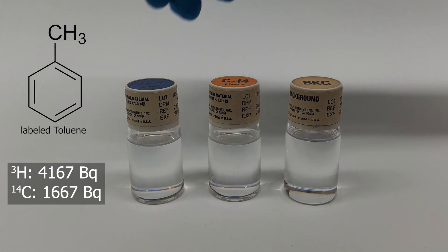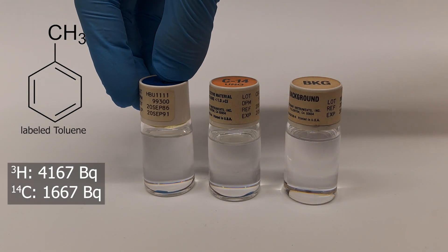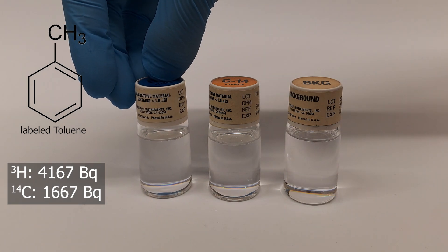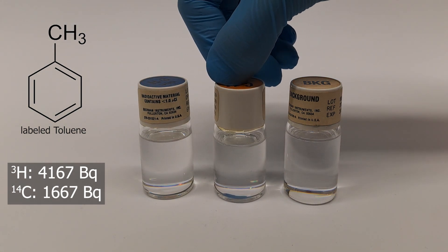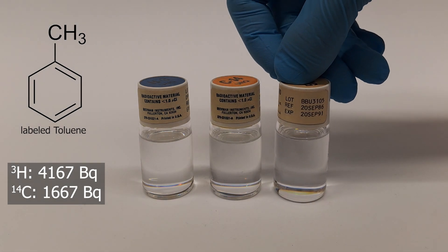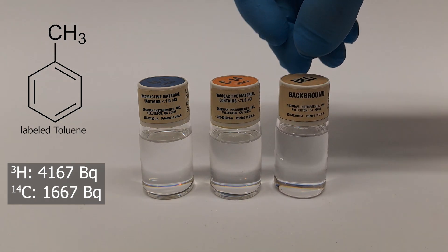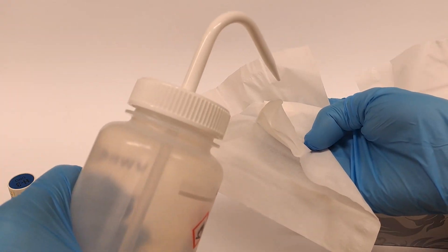4167 becquerels of H3 and 1667 becquerels of carbon-14 are contained in these 20ml solutions in the form of labeled toluene. So either the carbon in C7H8 is radioactive or the hydrogen is. The activity of hydrogen is now significantly lower, but I don't know when they were purchased, so I can't calculate that.